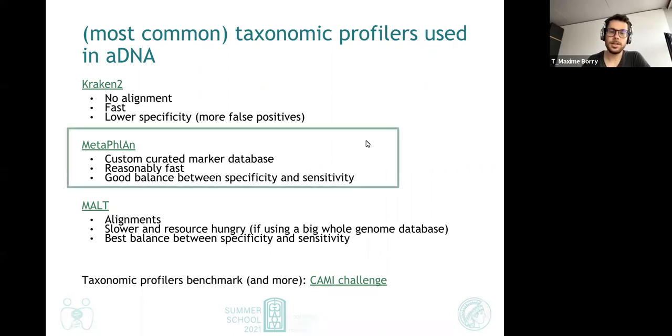So the one that we're going to demonstrate today is MetaPhlAn. And if you actually want to learn more about which taxonomic profiler or taxonomic classifier is the best, I invite you to check the CAMI challenge. I put the link here on this slide, where they compare, among other things, taxonomic classifiers on different samples.